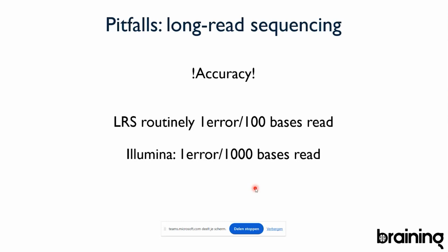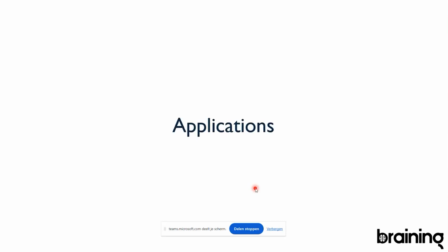So in that sense, it would be as efficient, or cost effective, to do long read sequencing compared to short read sequencing. Okay. Then we can move to applications, right?